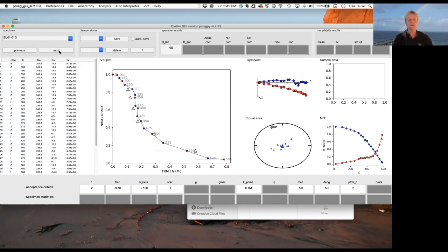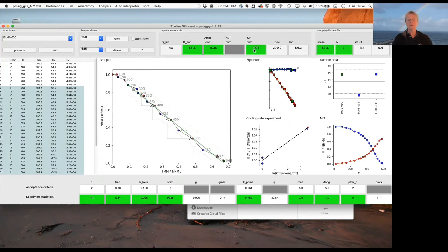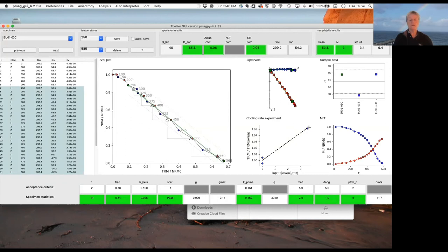Looking through, we find one that passes. This sample had three specimens that passed — we're looking at the first one. This is the ancient field, adjusted by an anisotropy correction calculated earlier and with the cooling rate correction. Here are our two fast experiments and the slow experiment. The solid red line is the original cooling rate estimated for these samples in the paper. This is somewhat zigzaggy but it passes all our criteria — everything is green.